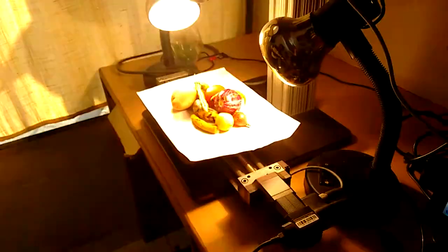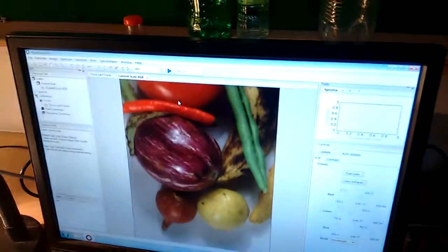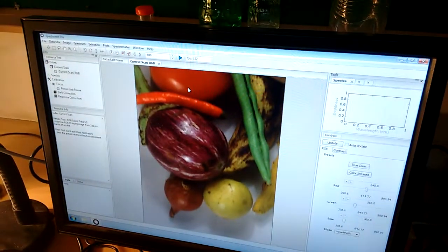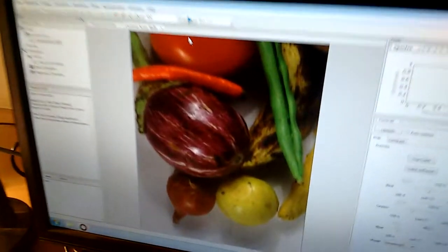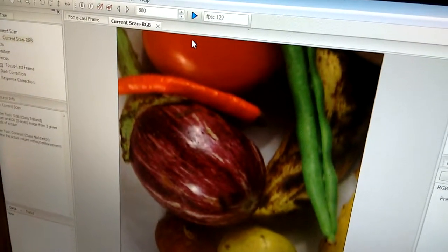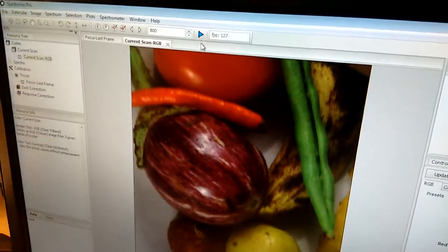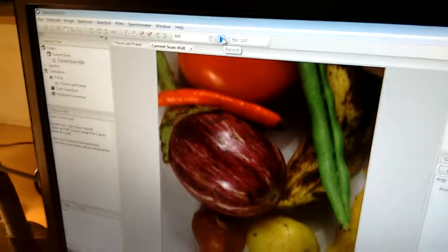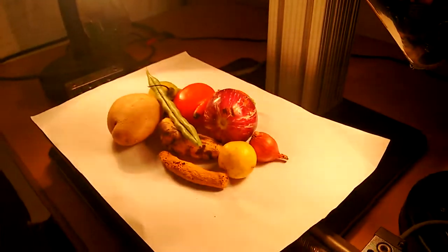Now you saw the data acquisition panel, how it took the image. Now you can see how the imager runs to get this image. Once again I will run the same run and you will see here.